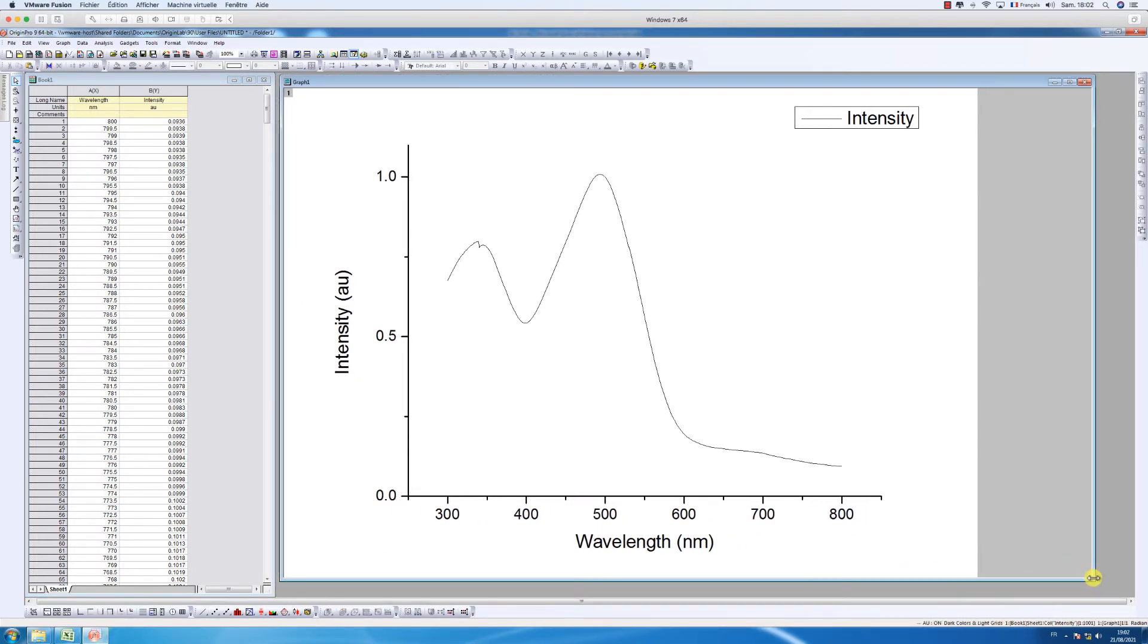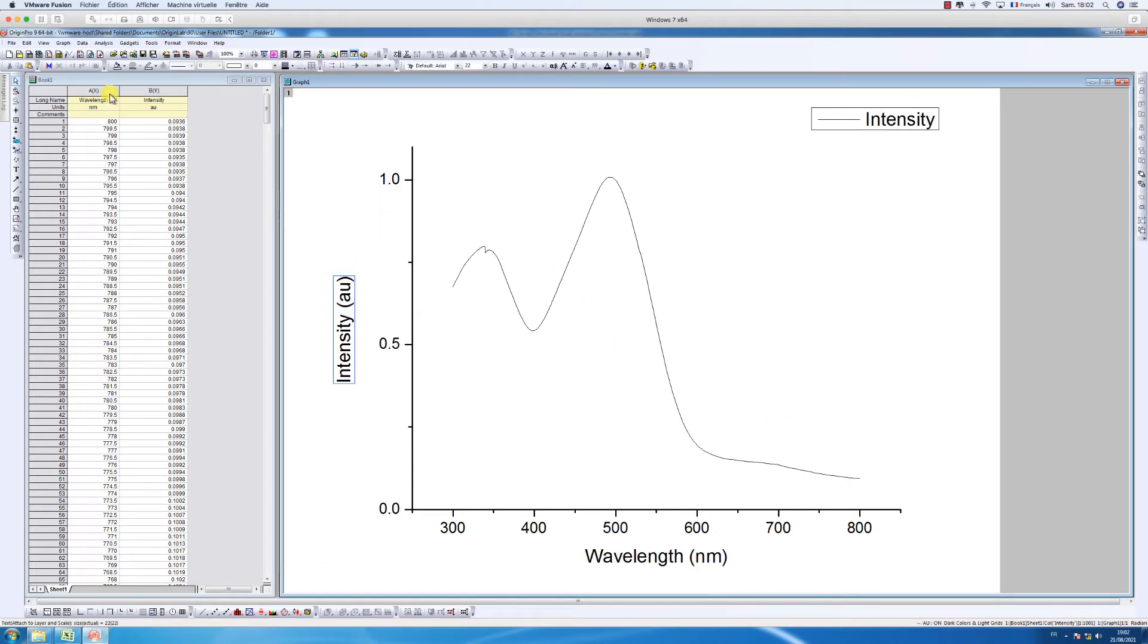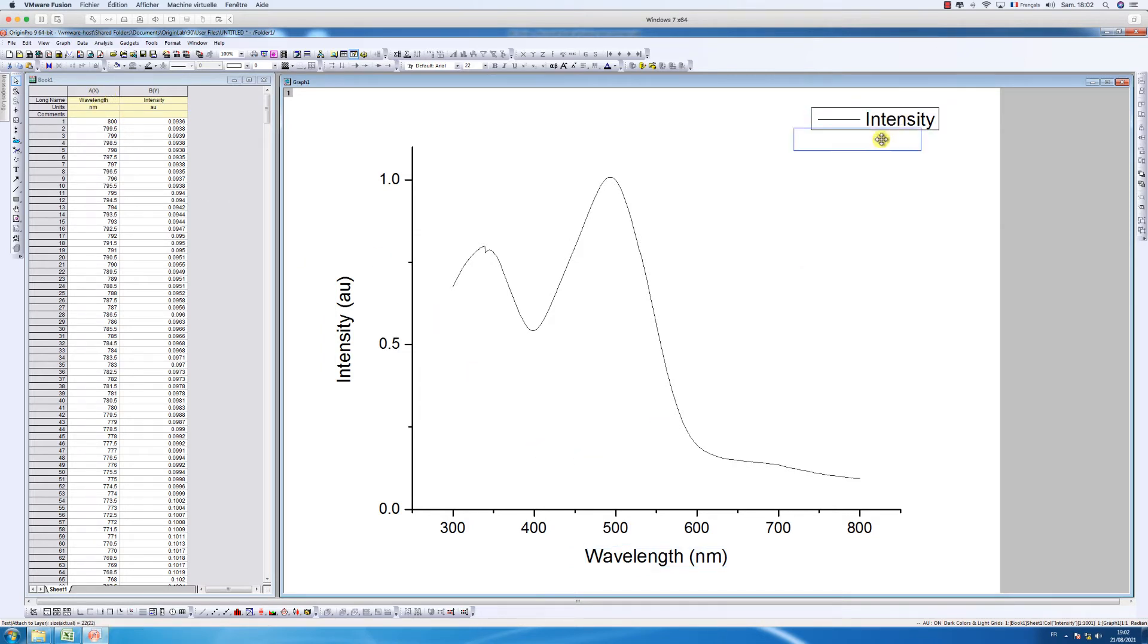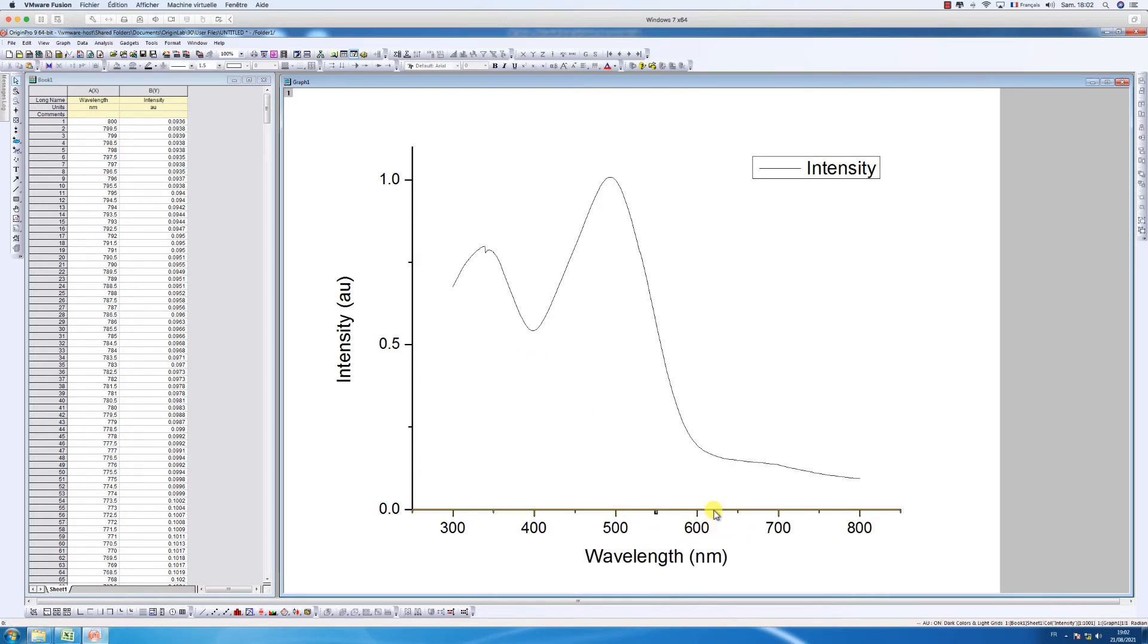And here we go. Here the graph, as you can see you automatically have the name of the x axis and the y axis. As you can see you can also enter them manually, but this way is the best one.